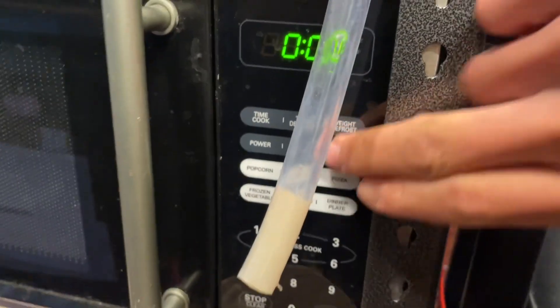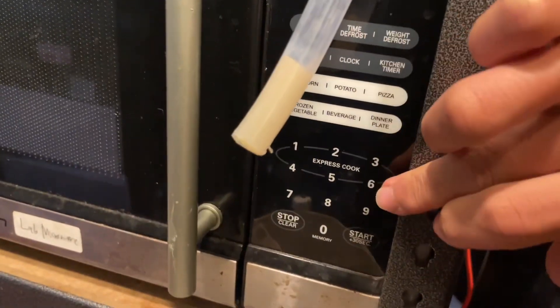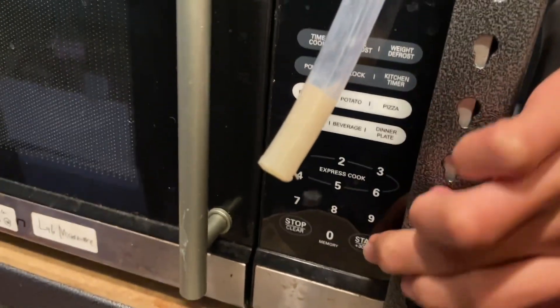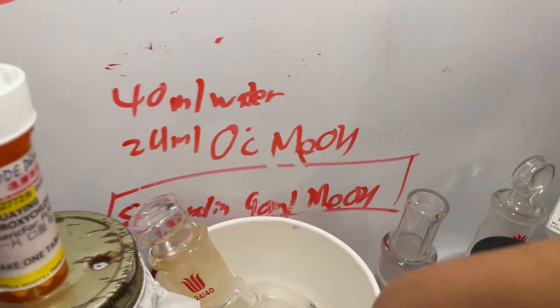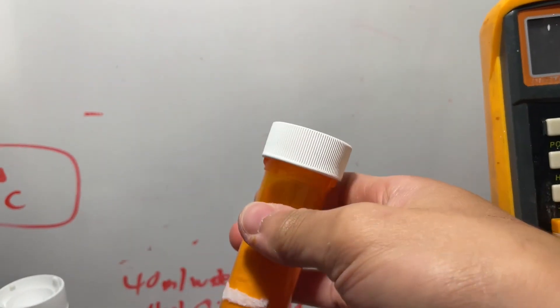I'm going to try drying the final product further in the microwave because it's convenient — just 10-second intervals, blowing a fan over it while shaking the beaker in between. This method works quite well. Here's our final dried product; you can see it's quite heavy as I'm trying to demonstrate by throwing it up — though I could probably just weigh it instead.